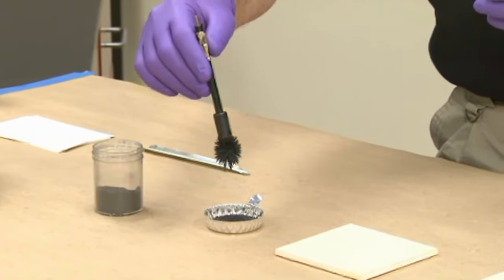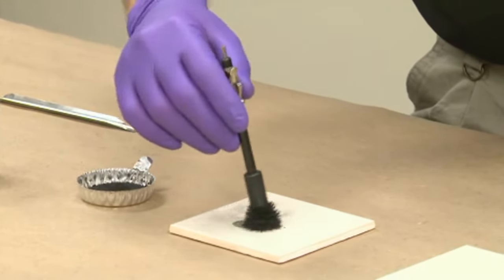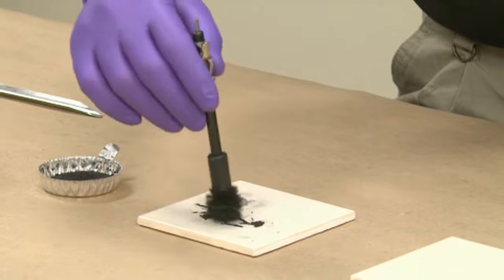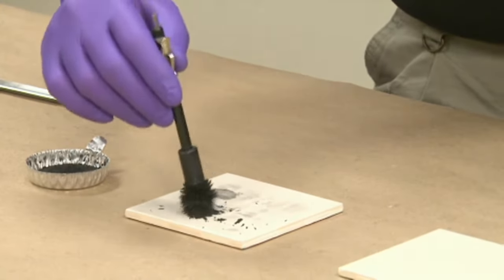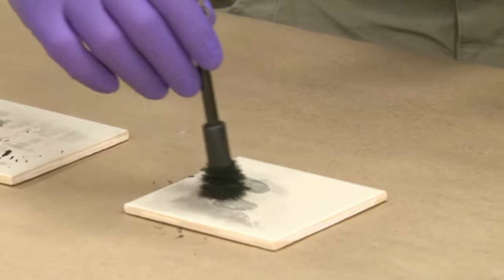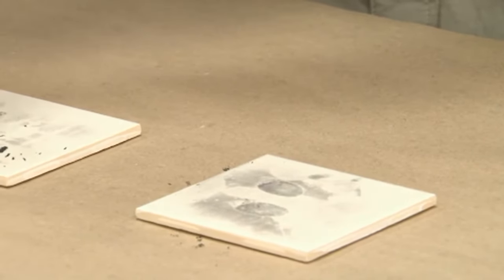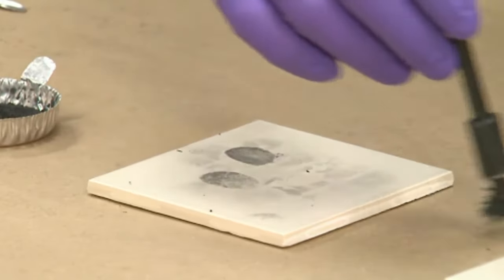Typically, how you're going to apply it is to go in a swirling motion and just go over it without touching the actual magnetic wand to the surface — you don't want to scrape that through. Apply it until you get good development. It is possible with magnetic powder to develop to the point of wiping the print off, so you want to get it to that point and not go any further.